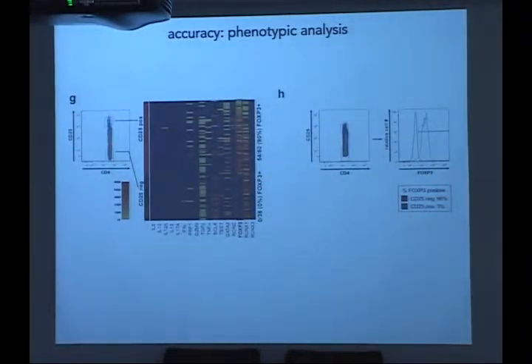So it's tough to validate transcription factors because you don't really get cell surface markers that can recapitulate transcription factor expression that easily, with one exception being FOXP3. So we sorted CD25 high populations and CD25 low populations. And you could see in the CD25 high population, we're getting FOXP3 90% of the time. In the CD25 low population, we never get FOXP3. And of course, we get all these other transcription factor signatures in these single cells at the same time.